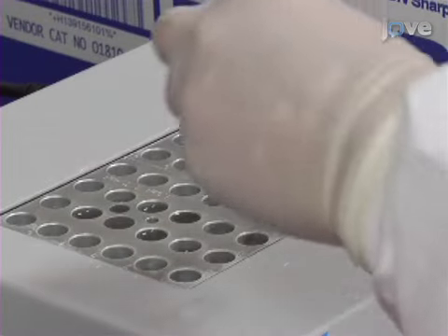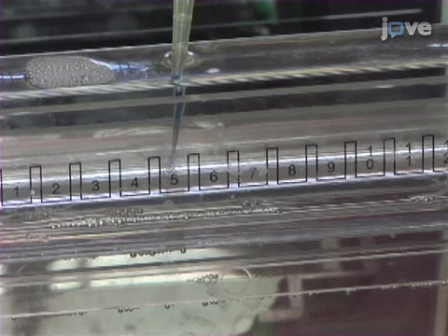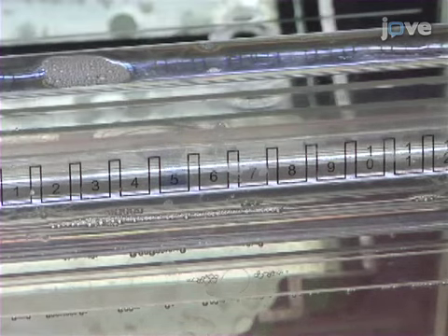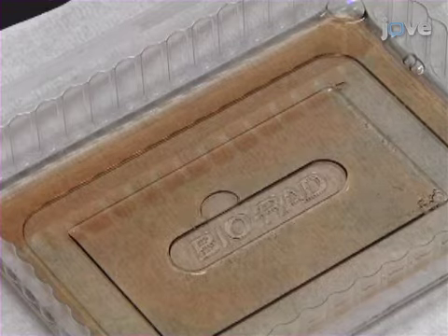After concentrating the eluates by acetone precipitation, boil the samples in Laemmli sample buffer. Then, separate the proteins by SDS-PAGE on a 4 to 20% Tris-HCl Criterion precast gel. Stain the gel with Coomassie Brilliant Blue R250.